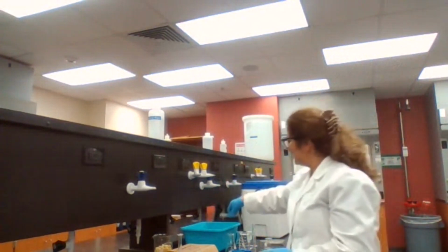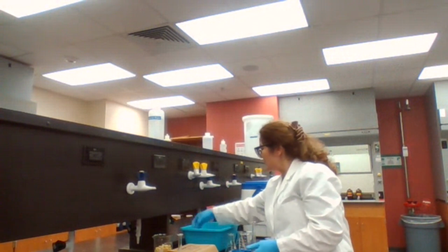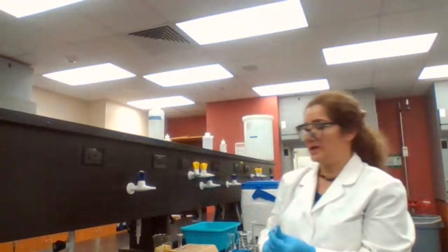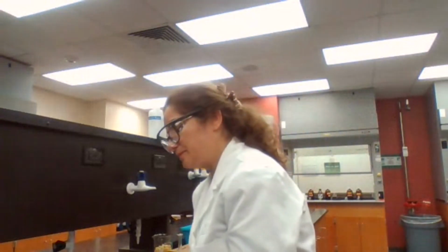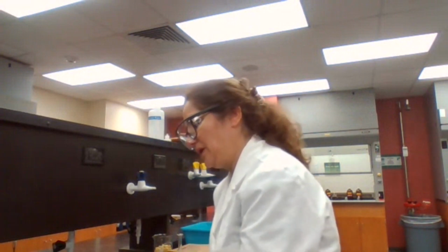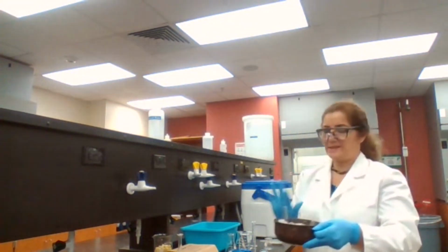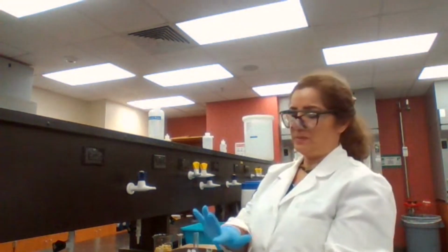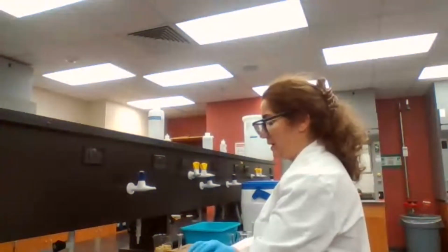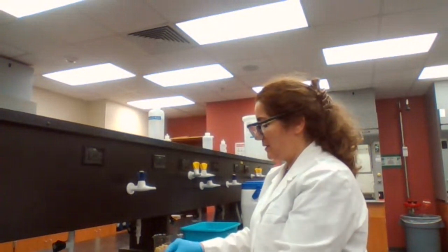So for the next test tube, I need to get the nitric acid and sulfuric acid mixed, 0.5 milliliters of each. So that would be 10 drops of each. We place the nitronium ion in one test tube, and the other one, the methyl benzoate with sulfuric acid, in another test tube.